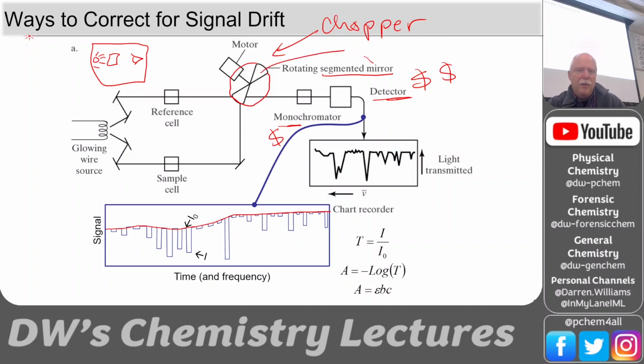So this mirrored surface, if we were to look straight on, it would look like this. So this is mirrored, and this is clear. And then we just put it at the correct angle so that it reflects the sample light into the monochromator.